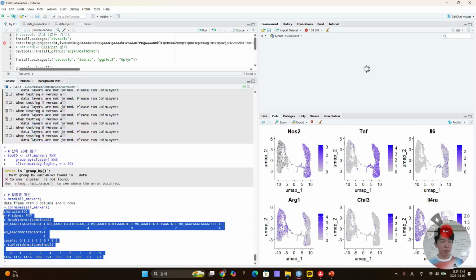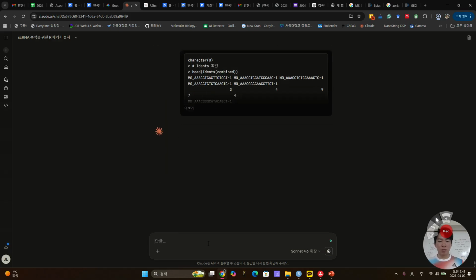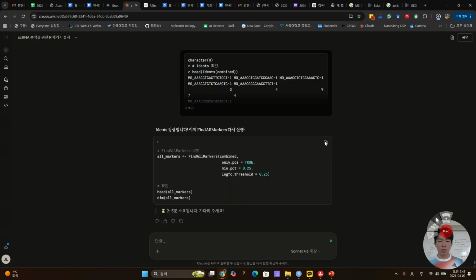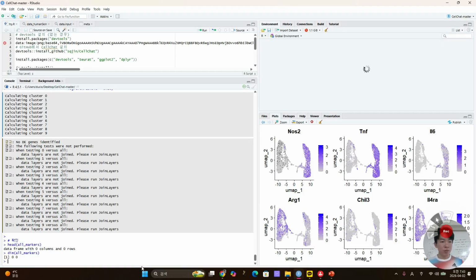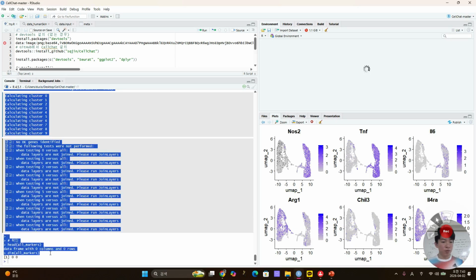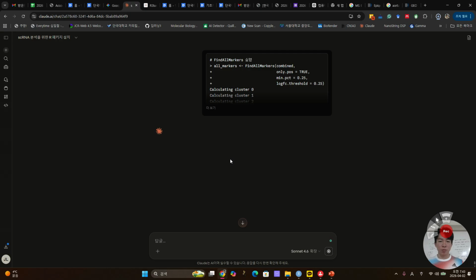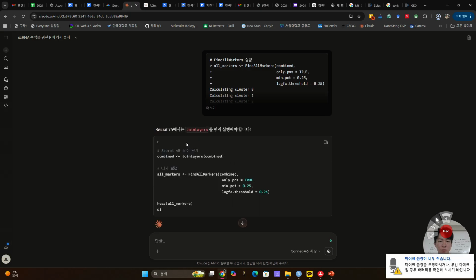Okay. Click. Oh, now they're making it. They're saying we are performing certain things.